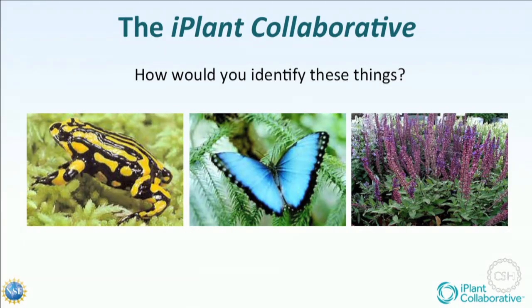So what I want to do is just get started. So let's take a look at barcoding. Now, if you were to step outside in any part or neck of the woods where you are, you might be able to find a couple of things that are physically here: a frog, a butterfly, and a plant. But you might not particularly know what this butterfly is, nor would you most likely identify that you probably have some sage to the right there as a plant. But the question is, if you did know anything about these, how would you physically approach looking at this?